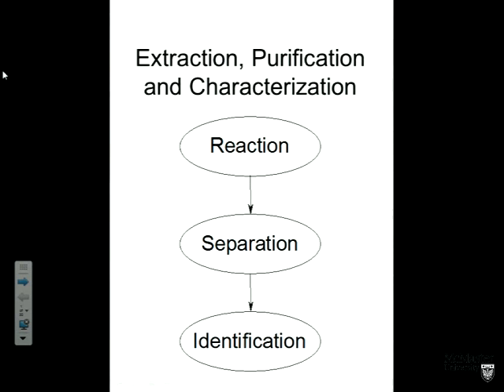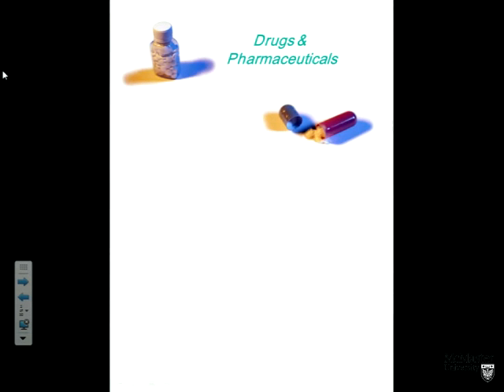So you in the lab will be required to perform separations. In experiment 1, you're given a very simple mixture, probably of 2 or 3 compounds, I forget now. It's a mixture, and your challenge is to separate those compounds out, and you're going to use a very simple identification technique. You're going to use the melting point, comparing the melting point of your purified material after you've separated it with a bunch of known melting points to determine the structure of, I think, a carboxylic acid.